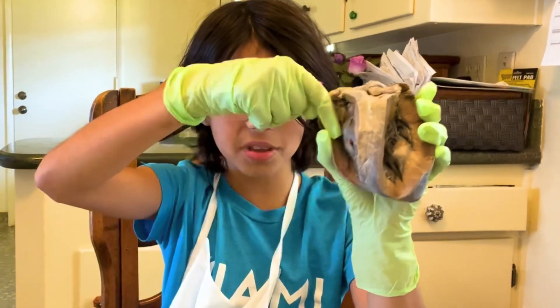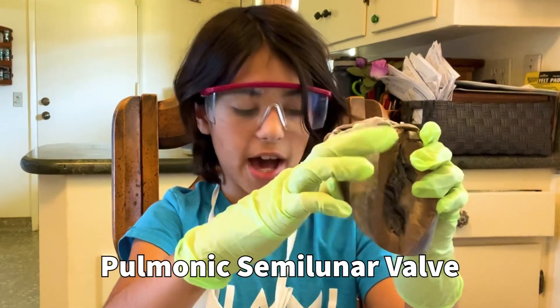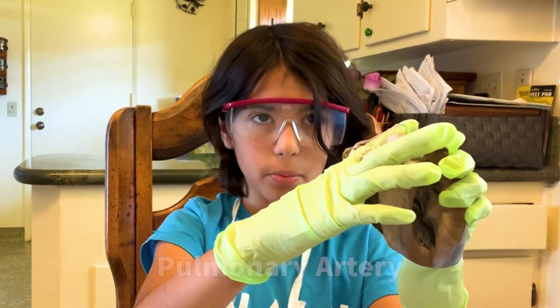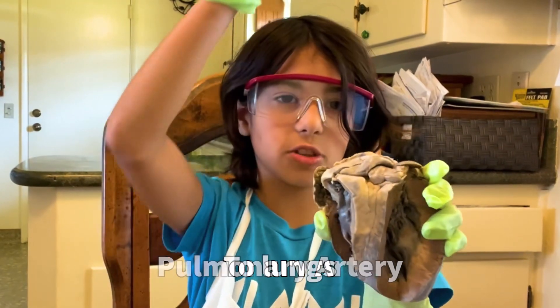And then the right ventricle pumps the blood and shoots it all the way up to the pulmonic valve, and it pushes through here to the pulmonary artery. And then from there, it goes to the lungs.